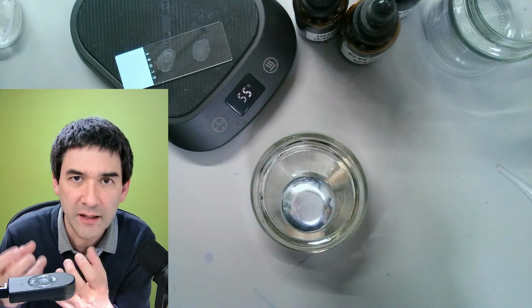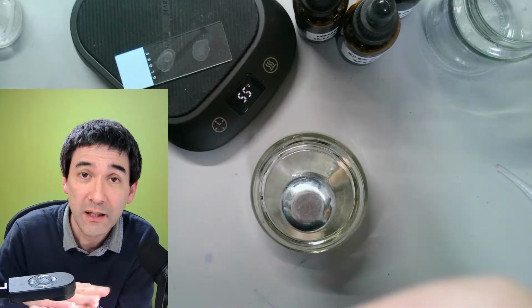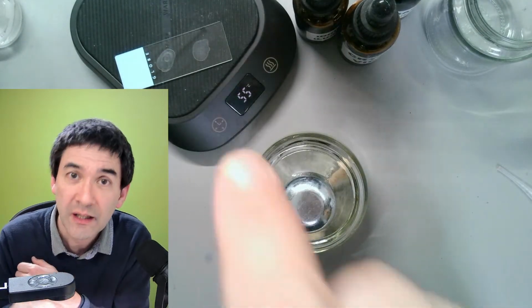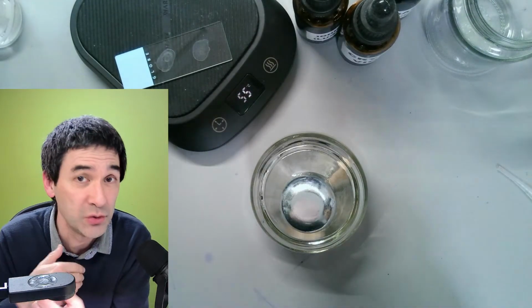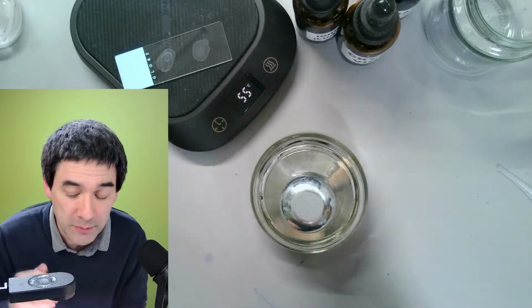It's like an egg in a frying pan that sticks, or meat that you fry without oil. It will stick to the frying pan. And this is what we're doing here as well. It's important that the cells stick to the glass slide. Otherwise, they're going to be washed away during the staining process, and that's not what we want. Okay? So heat fixing is absolutely central, otherwise they're going to be washed away.